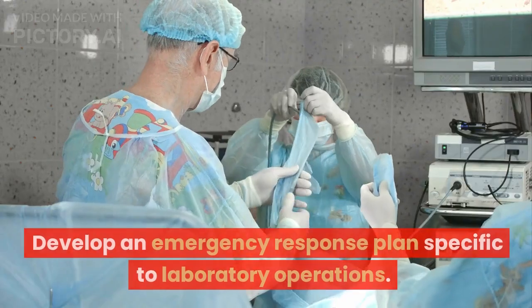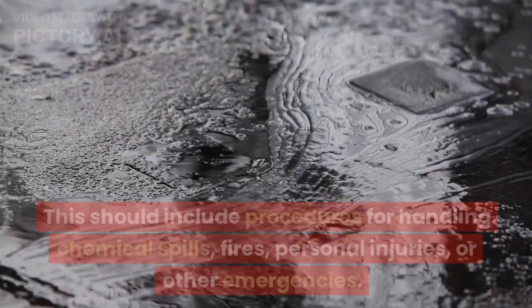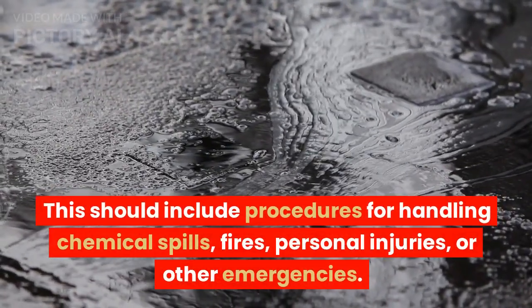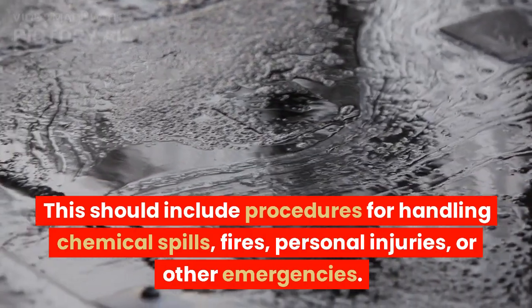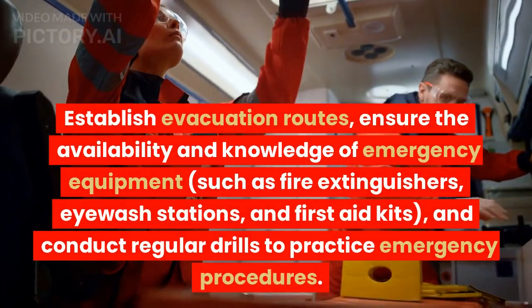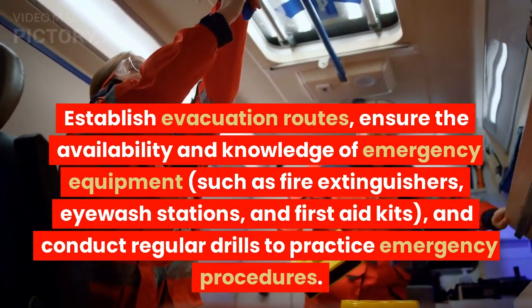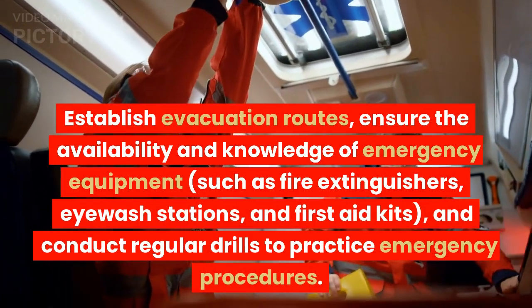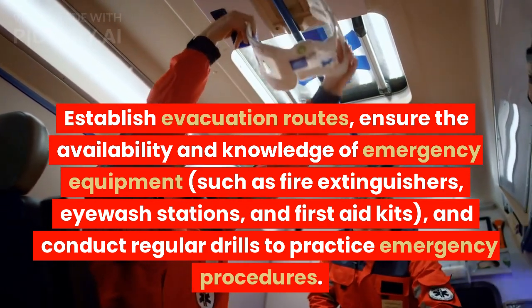9. Emergency preparedness. Develop an emergency response plan specific to laboratory operations. This should include procedures for handling chemical spills, fires, personal injuries, or other emergencies. Establish evacuation routes, ensure the availability and knowledge of emergency equipment, such as fire extinguishers, eye-wash stations, and first aid kits, and conduct regular drills to practice emergency procedures.